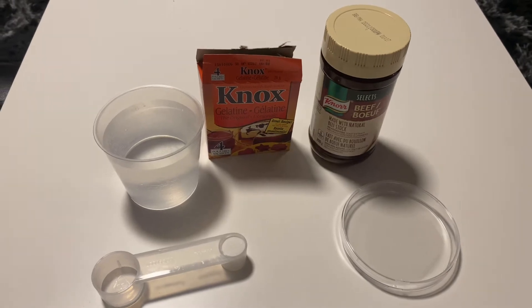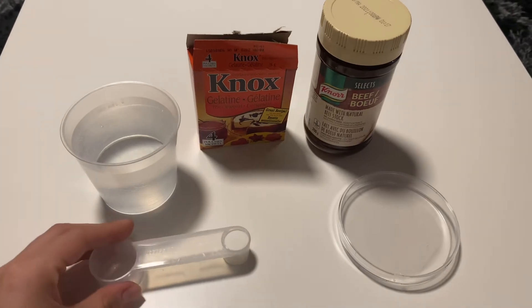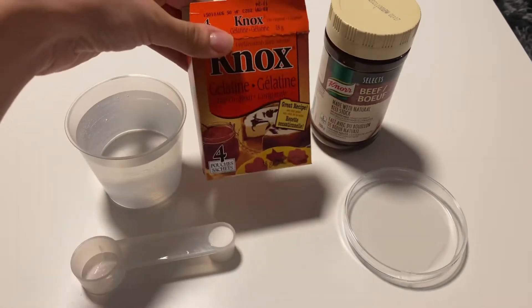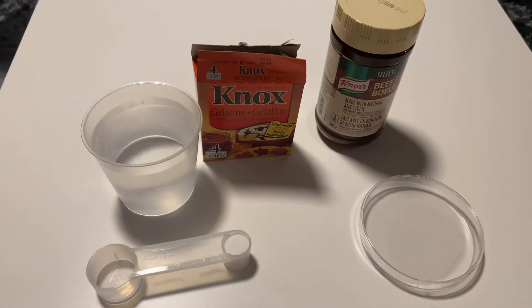For this project we need 1 cup of water, 1 teaspoon of sugar, 1 teaspoon of gelatine, 1 teaspoon of beef extract, and 2 petri dishes.